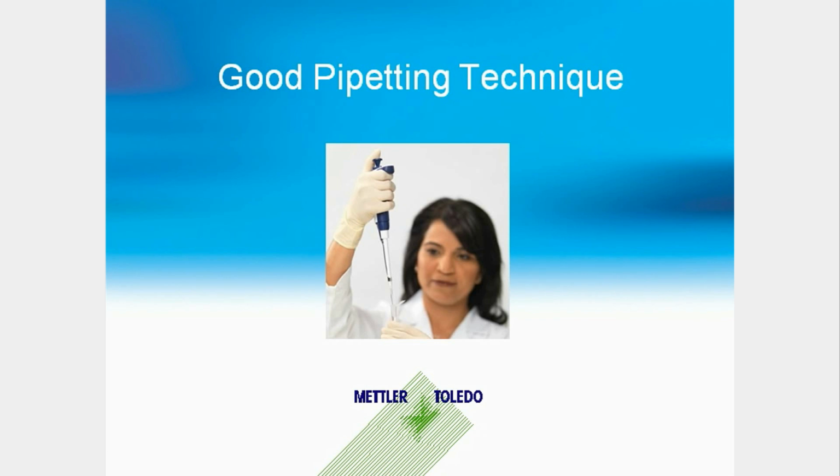Welcome to this course on good pipetting techniques. We will review a range of pipetting techniques and show you the positive effects that improving technique can have on reducing errors and ensuring data quality.